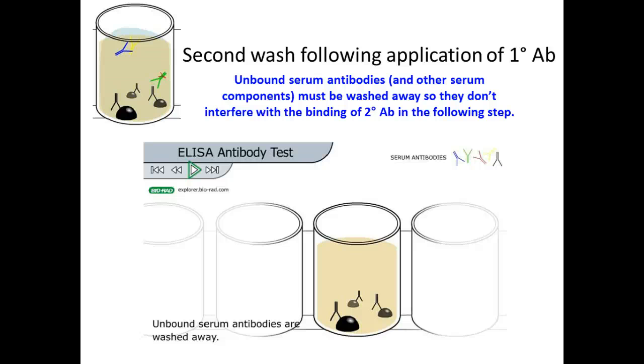Yeah. Since your secondary antibody reacts to human, it doesn't matter even if it's your target antibody. Is any antibody in there at all?